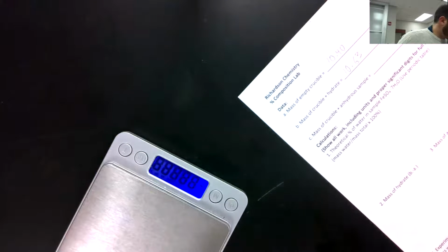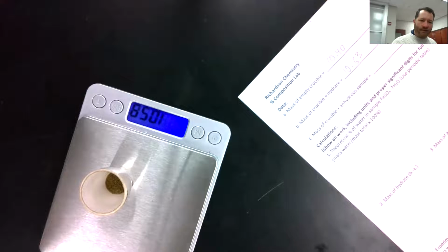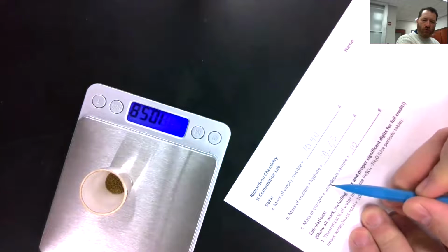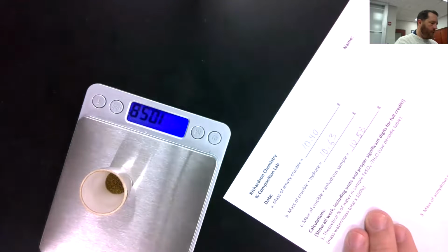All right, welcome back. Again, doesn't feel like more than a few seconds probably for you, but it's been a few minutes now. And our sample has successfully cooled. Hopefully dried as well, because that's what we're trying to do: find how much water has been driven off. So I've got my dry sample, and we'll put it on the balance there. That is the mass of the crucible. It's the third data point here: the mass of the crucible and anhydrous sample. Anhydrous means dried sample. All right, so there we go.